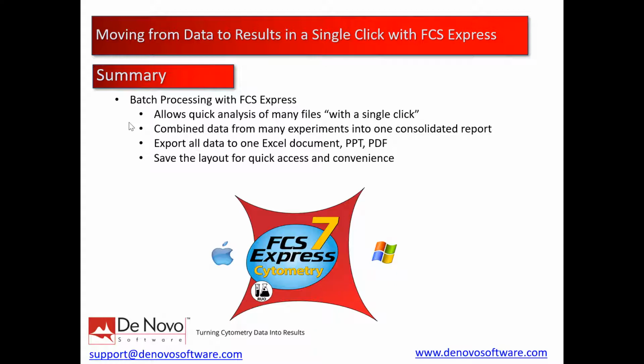And importantly, you can save that layout for quick access and convenience in the future. So anytime you have a similar experiment that you need to run, you go and draw up that template, you can click run on the batch process, and you'll be all set.